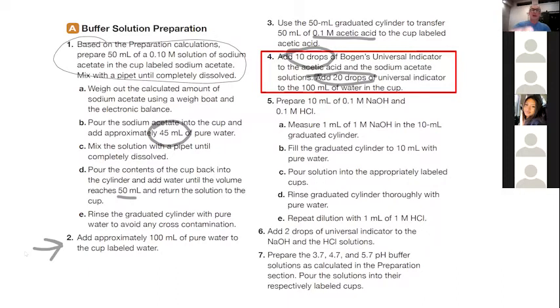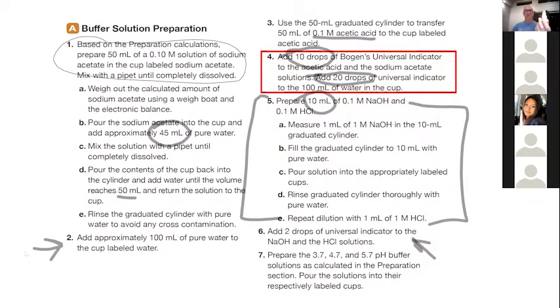So if you haven't got the small bottles of sodium hydroxide and HCl, you can just dilute them from the more concentrated version and just put that in like one of the small cups. Add 2 drops of indicator to each of those. So you want 10 mils. So we're going to be squeezing like 10 mils out of these if you have them. I don't know what the total volume is. Ooh, 15. Yikes. So yeah, we may have to make some new solutions for our next lab.